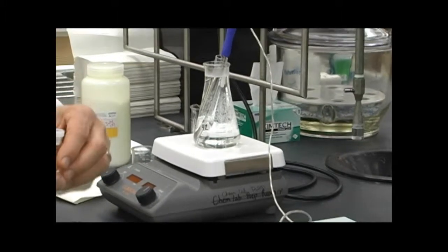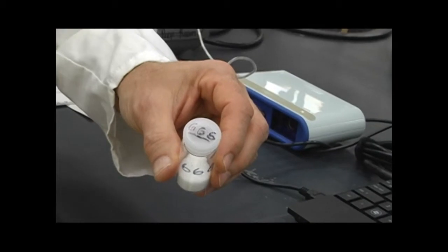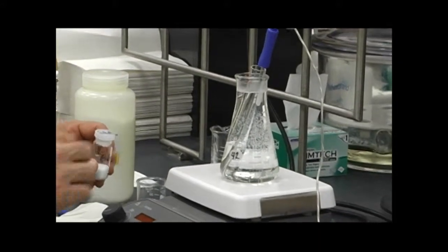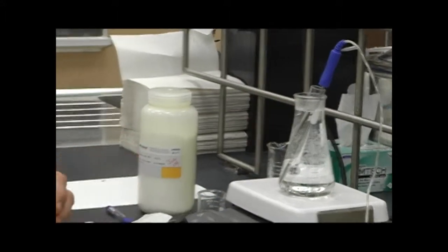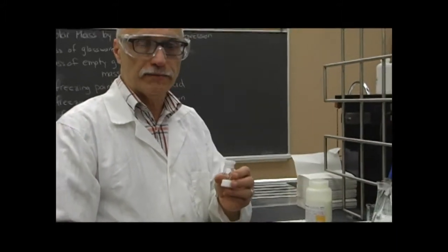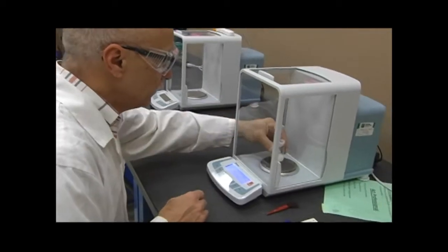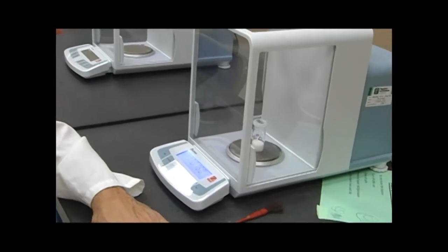So now we'll be taking our unknown, recording the unknown number, and then we'll put it into the melted lauric acid, and it already has. So that's nice. So we'll just turn it off. Okay. So we'll go weigh the vial with it, pour it into the test tube, and then weigh the vial empty, and we'll know how much unknown we have put into the solution. We have our vial with our unknown. We've recorded the unknown number, and we record that.